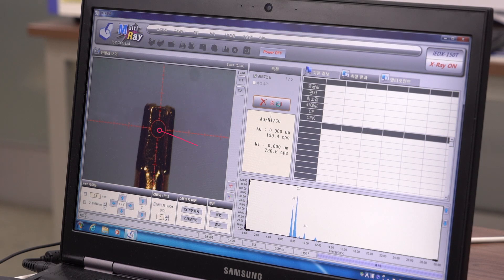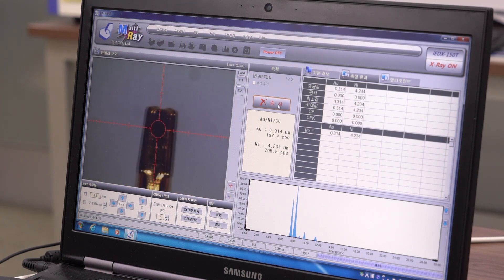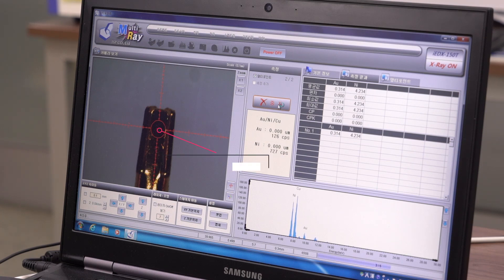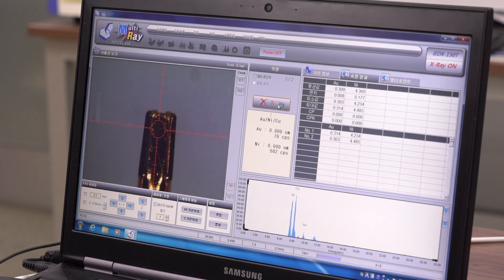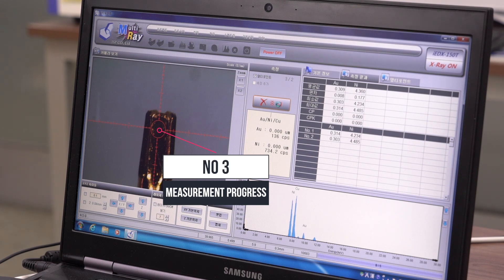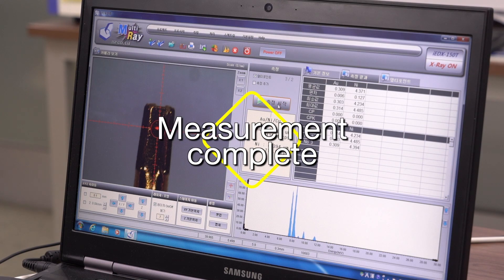Start measurement from the first registered point. Measure the second point you registered. Measure the registered third point. When the measurement is finished, the measurement is completed after moving to the first point.